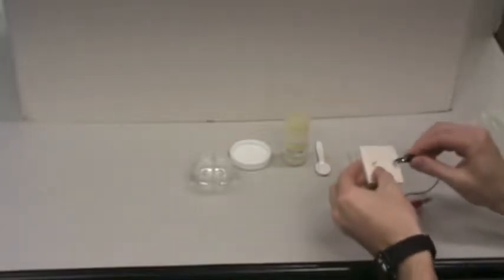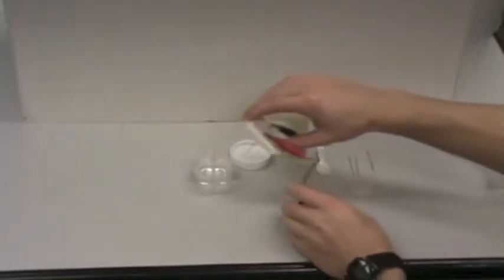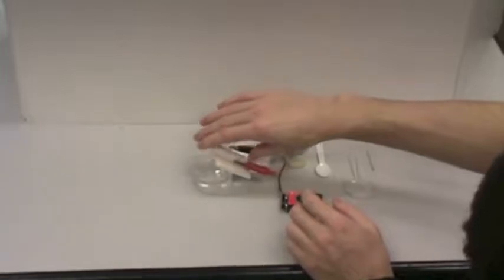Place the electrodes connected to the 9-volt battery in the jar containing distilled water so that the electrodes are in the water. Walk around the class and ask students if they can see any bubbles forming around the end of the electrodes in the water. Tell students that distilled water does not conduct electricity, so the electricity generated from the battery could not travel through the water to decompose it.